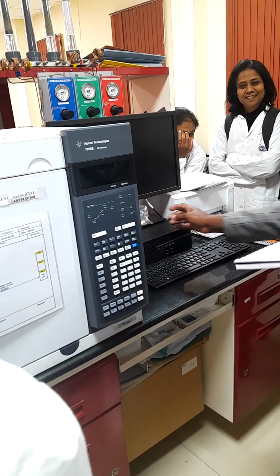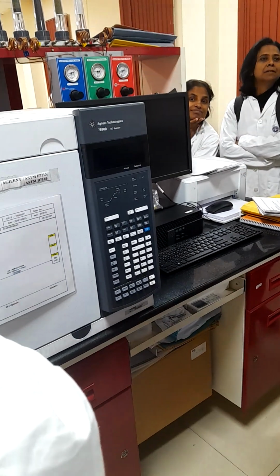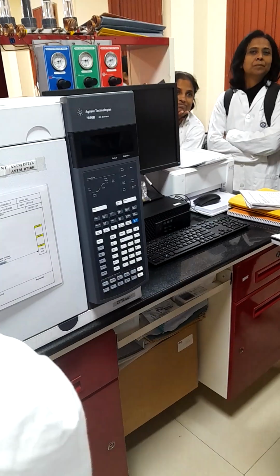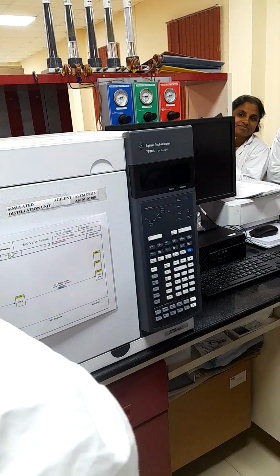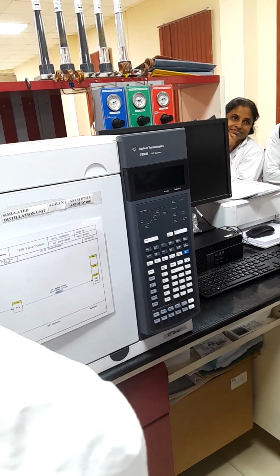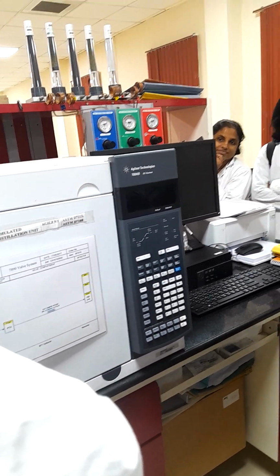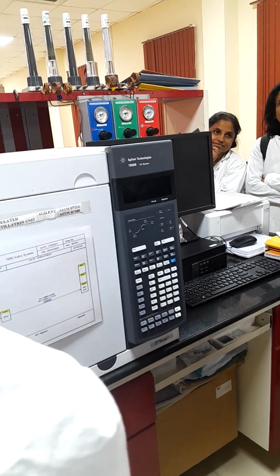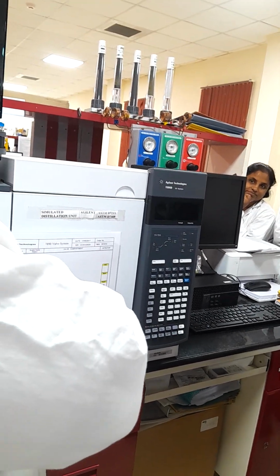You know the GC? Exactly. Name me the three parts of GC. There is an auto sampler, there is an oven, and a column. Then there is a detector. Which types of detectors can be used? FID, MS, mass spectrometer. There is also ICP. ICP can be used. So these are the different techniques.